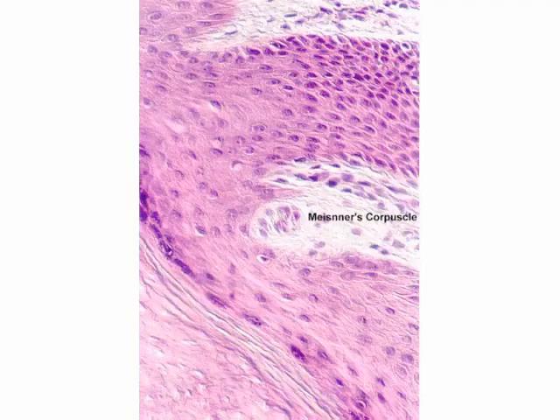Okay, so let's go to this next slide. Here's a few more. These are from your book and from some internet sites that I found. I believe this one may also be just in the slide listing in your exercise folder. But this is another Meissner's corpuscle you can see right there. Okay, so this is a sideways view of the skin, and you can see that Meissner's corpuscle.